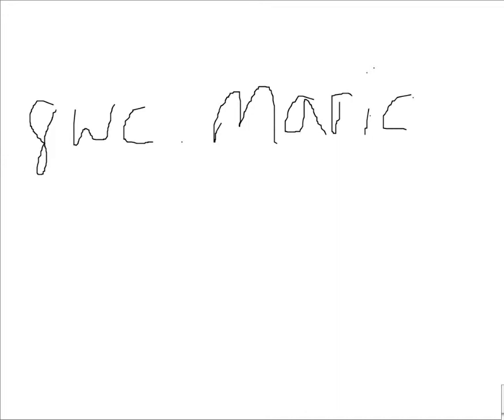So next question I would ask, do we see a lot of fibers packed in this matrix? And we'll go through what a fiber is, but again, know it when you see it. We do see fibers, right? Okay. We have some thin ones coming down around, some thicker ones, etc. Good, we do. So it's a looser type. Yep, loose fibers. Good. So again, we see fibers, then we're asking dense or loose, we have loose.